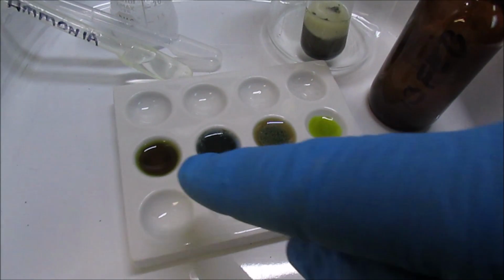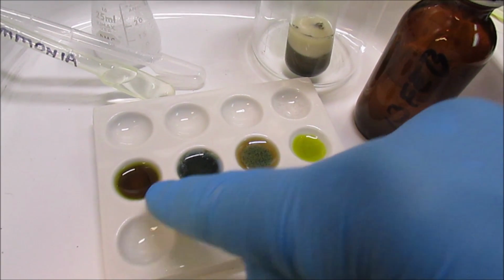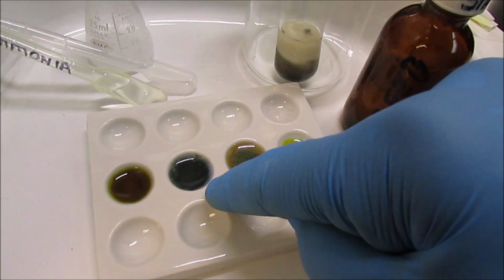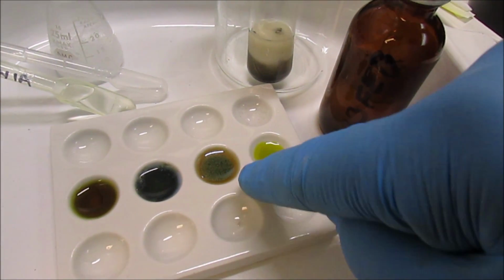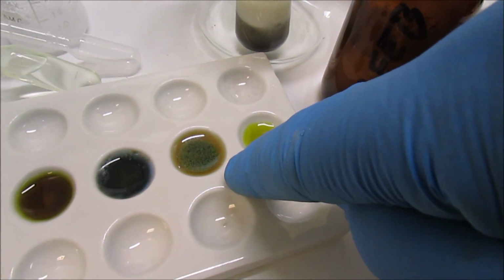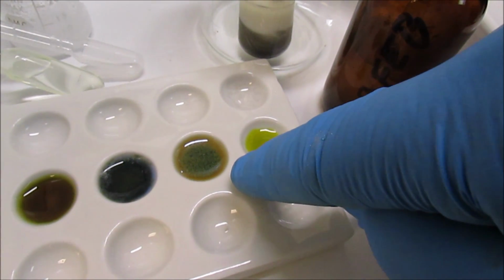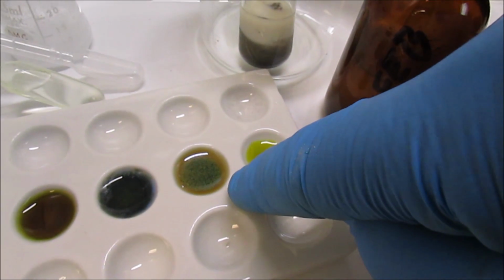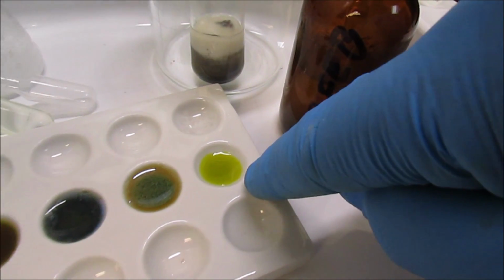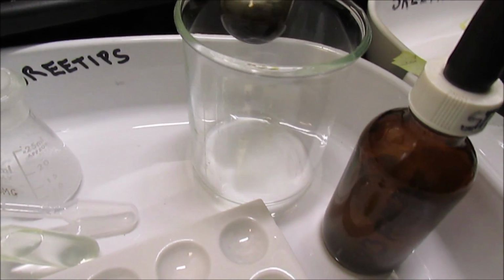Based on these test results, I've got platinum and palladium in solution. This is the stannous chloride. This is the ammonia. It turned blue, which means I've got copper in solution. This is the DMG. It's got a dark green precipitate down in the bottom there with some orange material left around it, which is probably platinum in solution. And I didn't do anything with this one. This is just a blank spot.